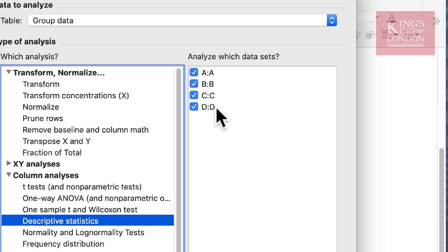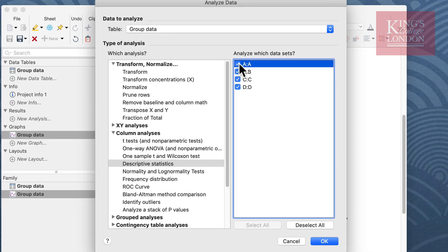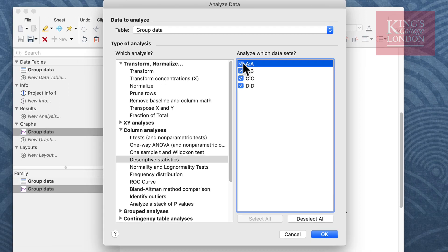If you have more columns representing for instance different experiments that you don't want to show these statistics for, you can deselect them simply by clicking on the little boxes next to each of the column headers. Having selected your data set you click on the OK button.